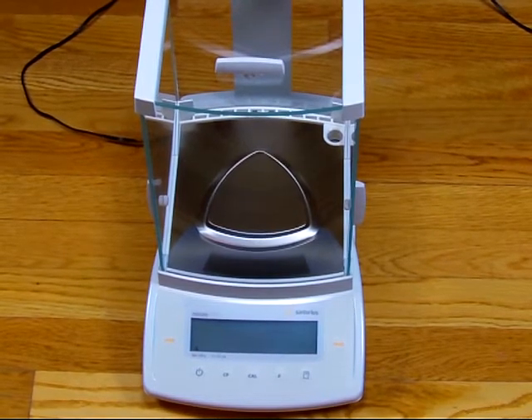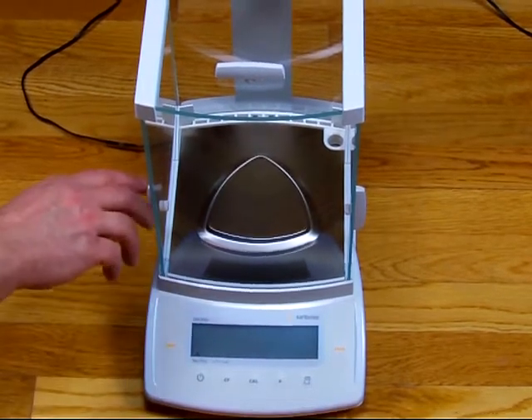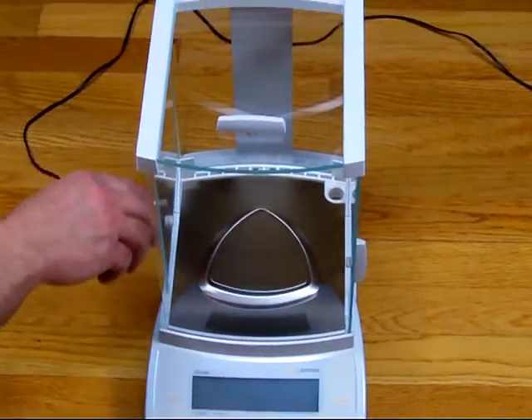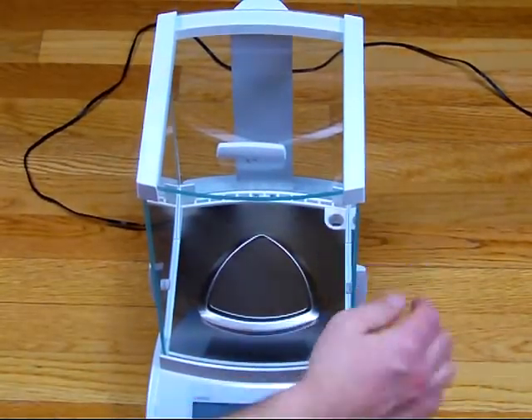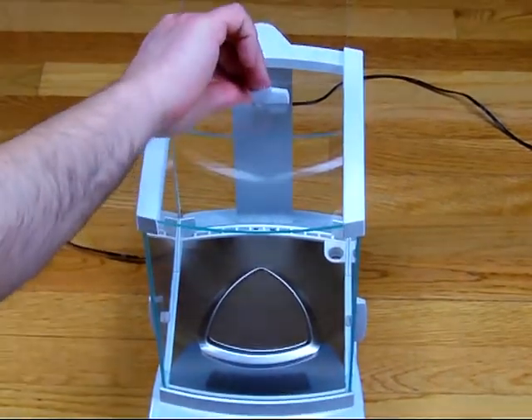The balance features a three-door glass draft shield. You can open it on the left, you can open it on the right, and you can access the weight chamber from the top.